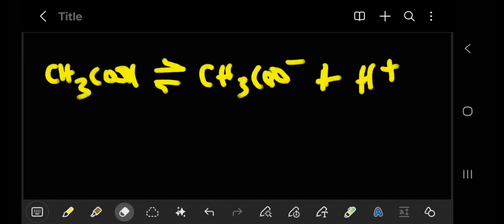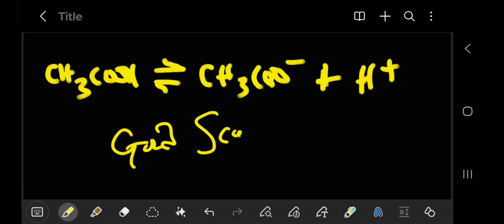Know how to account for the individual variables in your tables. I'm talking about the values. How did you get them? And also know how to plot your graph. Choose your scale correctly. Good scaling is important. And know how to interpret and how to calculate your slope.